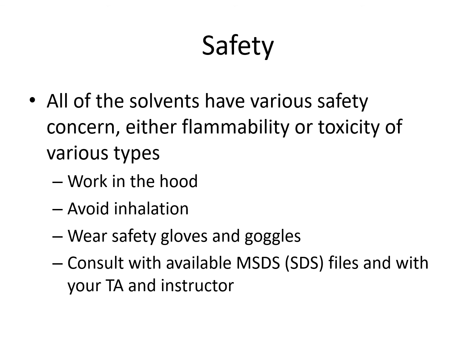Before you do the experiment, it is mandatory that you wear your safety gloves and goggles. In fact, if there are chemical safety data sheets in the laboratory, it's good if you read them before the experiment starts, or if it is during the experiment, you can ask your TA for help regarding the characteristics of the chemical or the solvent you're using.